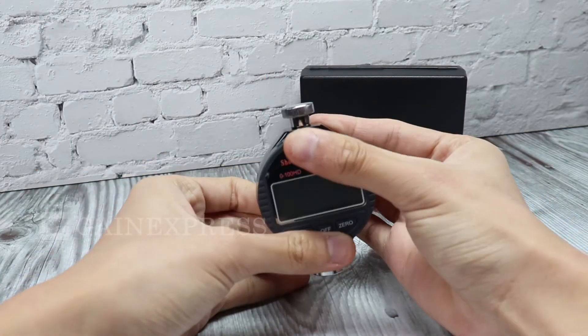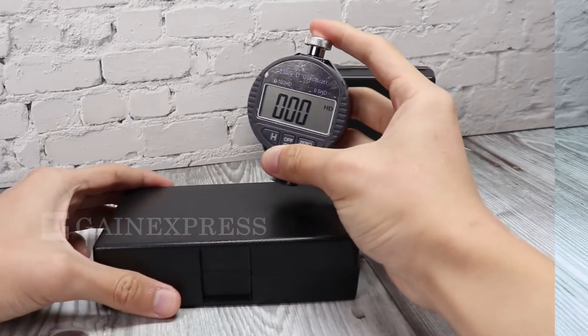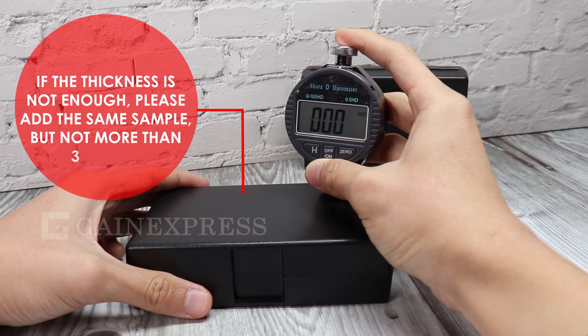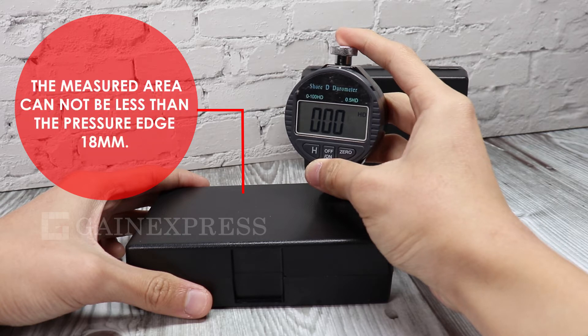The sensing pin is also part of the meter. To start the meter, simply press the On and Off button. The thickness of the measured sample needs to be more than 6 mm. If the thickness is not enough, please add the same sample, but no more than 3 layers. The measured area cannot be less than the pressure edge of 18 mm.